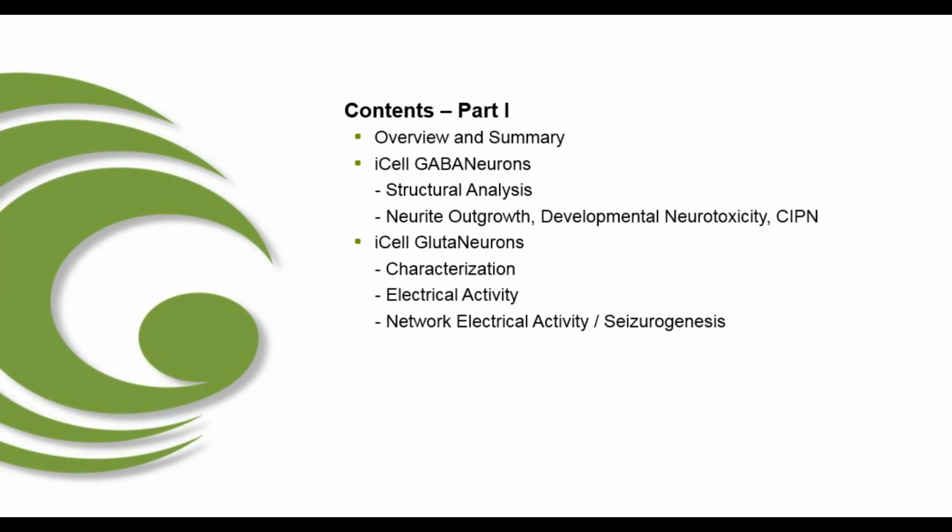So the first part of the webinar is talking about a reagent. The second part will be talking about how you actually implement that reagent in toxicity testing.